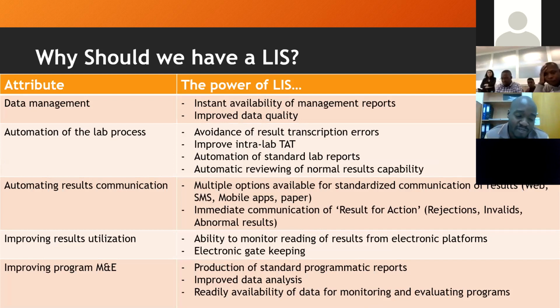The first attribute that I can highlight is data management, where instant availability of management reports is there, and there's also improved data quality, in the sense that there are rules put in an LIS to accept certain values with certain characteristics so that we have consistency in data.